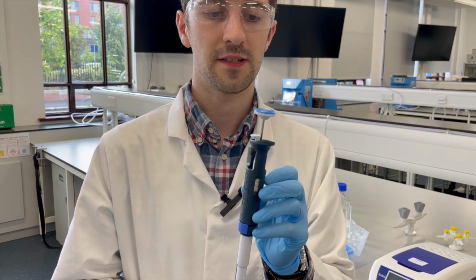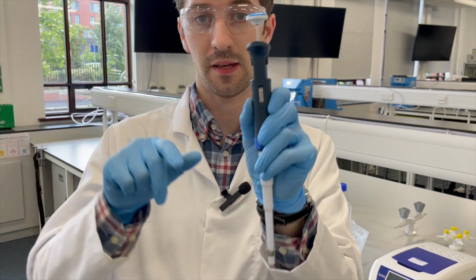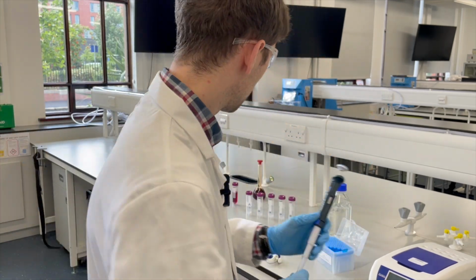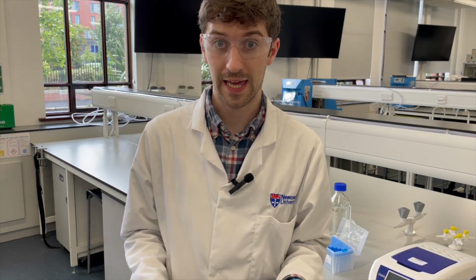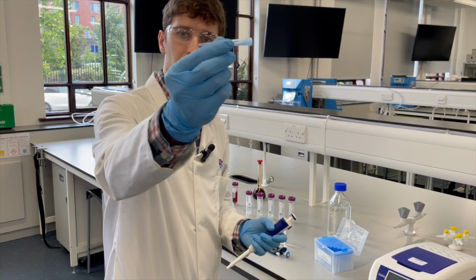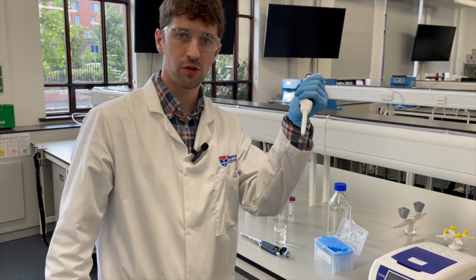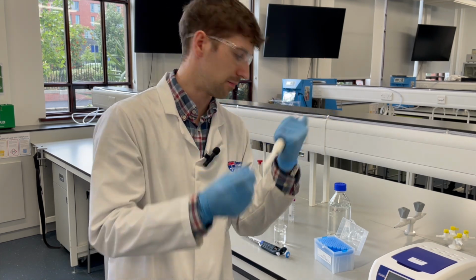Some other final tip is that when you use a calibrated pipette, you must never exceed the maximum, in this case it's 1,000, or go below the minimum. Again, as we say, 100 is that minimum, okay? And we have these blue pipette tips, which are used. You don't directly drop the solution into the pipette, you must always use a pipette tip, all right?